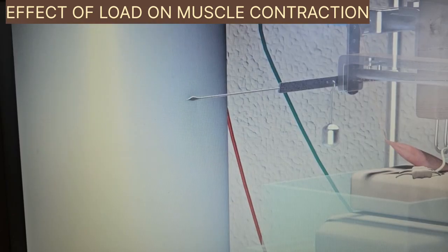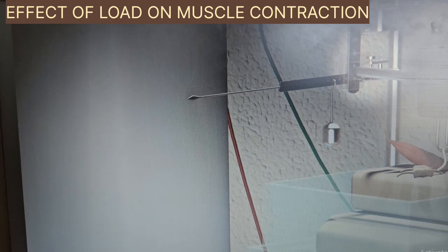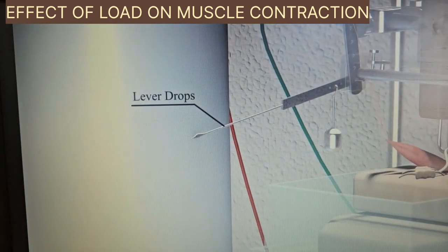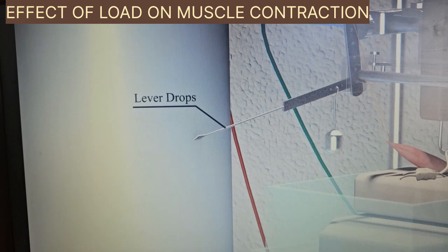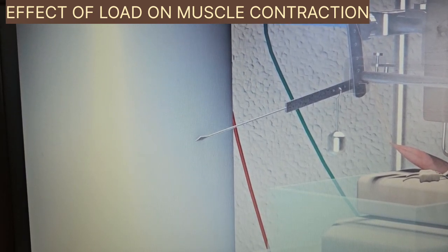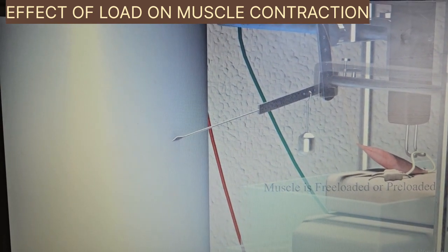We adjust with 80 grams weight at the fulcrum. We loosen the afterload screw. Immediately, there will be a drop in the lever as the weight acts upon the relaxed muscle and stretches it at rest. The muscle is now free-loaded or preloaded.